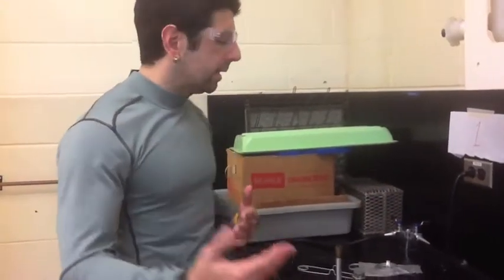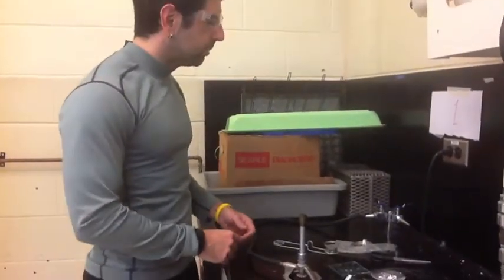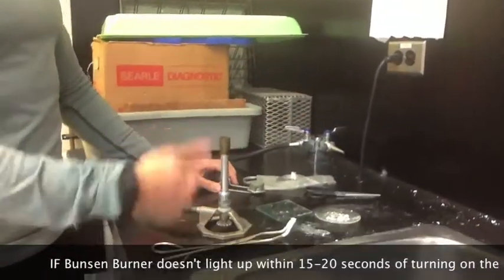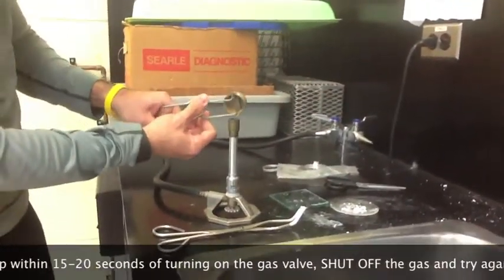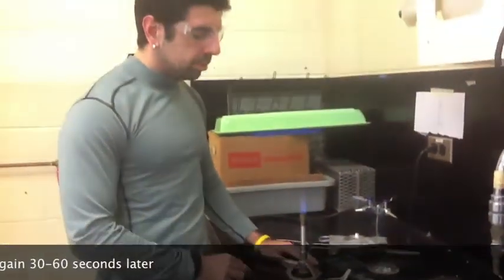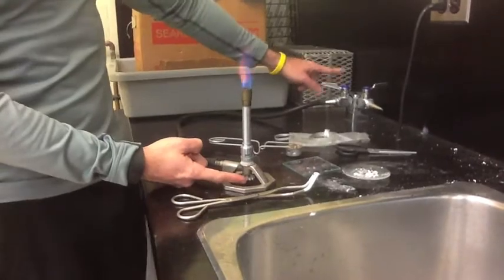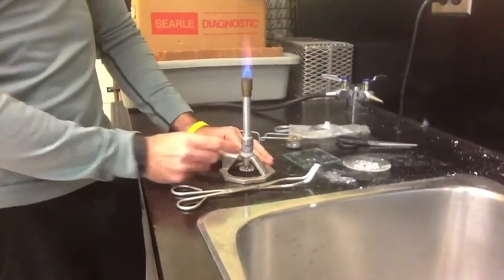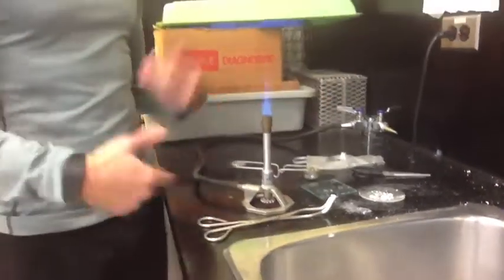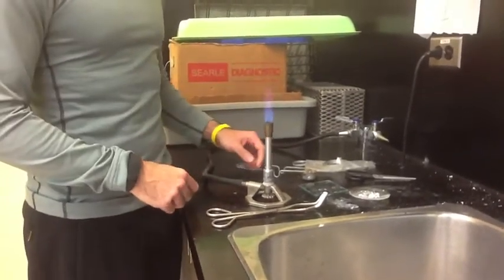I do have a video on how to light a Bunsen burner, but I'm going to do a quick demo. We open up the gas valve, let gas go through it, and light the Bunsen burner. And there we have it. We want to get a blue flame. We control the amount of gas coming through from this valve, and the amount of oxygen through this little air inlet, to allow for greater combustion, the so-called complete combustion, where we're letting lots and lots of oxygen in.